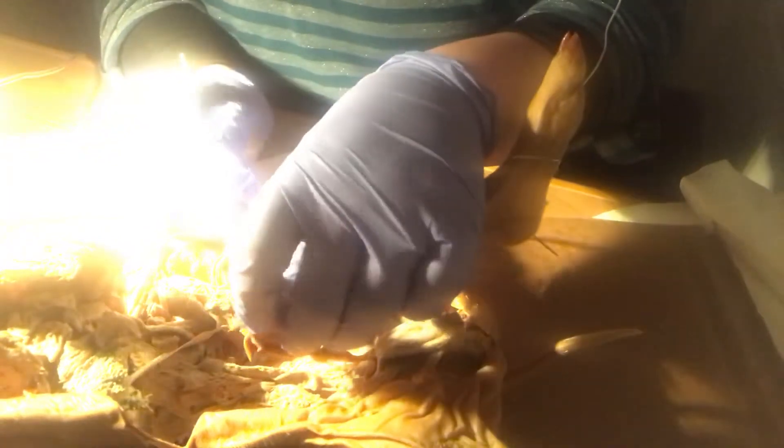I also took off the peritoneum here — it was covering the kidney. Now I'm going to remove the kidney slowly, and I don't want to damage it.